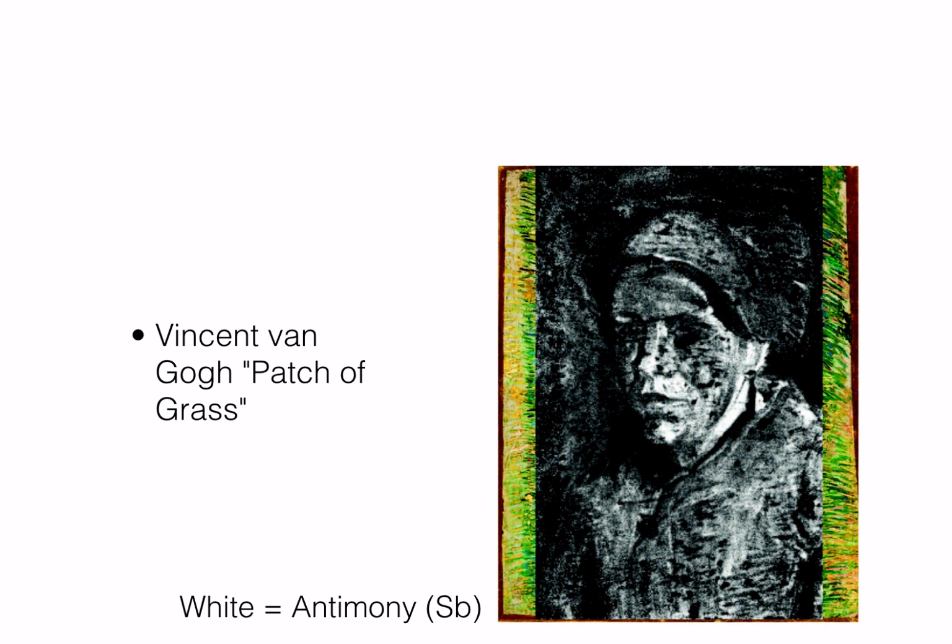That's right, there was an entirely different painting completely underneath the leaves of grass. This is because Van Gogh either didn't like this painting or had a change of heart about the subject and painted over it. This happens quite often. In fact, you'd be surprised how many paintings have entirely different underlayers. But in this case, we can use X-ray fluorescence to see the painting underneath. This is because it uses higher energy photons, and higher energy photons penetrate deeper. We'll discuss just how deeply a little more later.